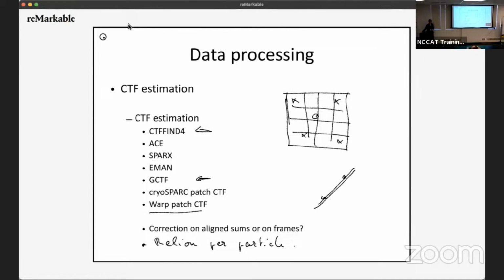So we needed to do the micrograph level CTF correction correctly. So the result will be even worse if we use the per particle CTF method. That's correct. So you're saying basically, if the initial CTF estimation wasn't done properly, the per particle CTF will actually make things worse. And the answer is potentially very much yes. It's only when we reach something like 3 angstrom resolution. In terms of resolution, that's a good question.